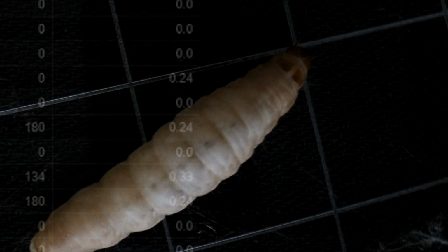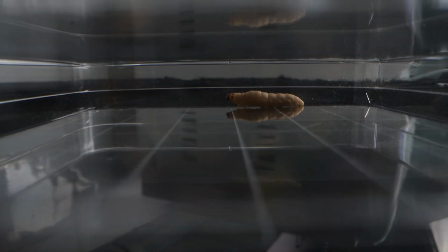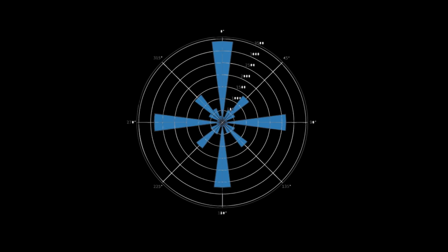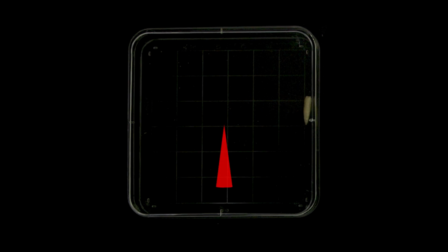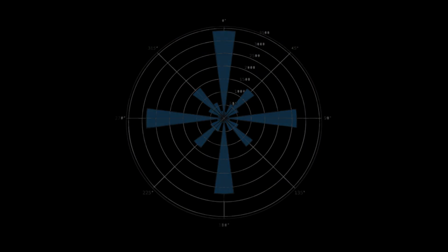Now, the patterns started to emerge and tell their story. The control group, meaning the larvae that weren't exposed to any substances, behaved predictably, going around the petri dish and sometimes taking shortcuts. The beauty of a rose diagram shows this behavior in the most elegant way. Just look at the larva's world map, compressed into a circle, sliced every 15 degrees, and the four main directions are instantly obvious: going north, going east, going south, going west, and sometimes taking shortcuts in other directions. The proportions are instantly visible, and pay attention to them as they will get more interesting soon.